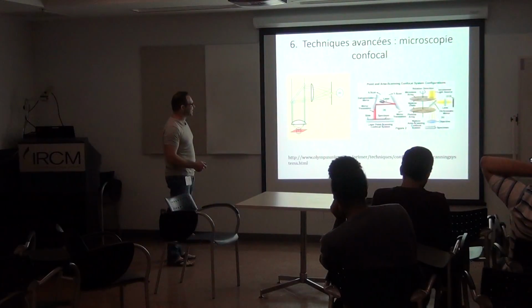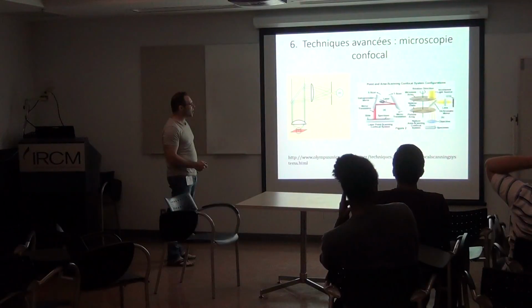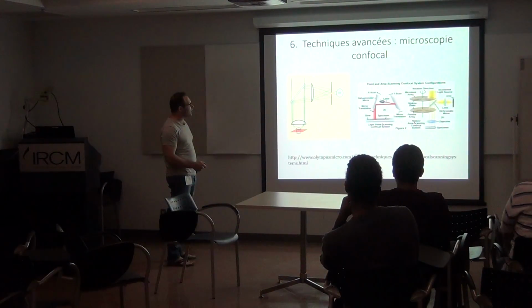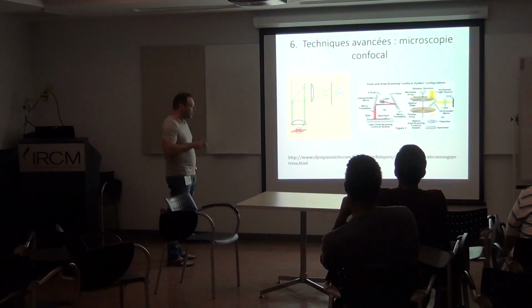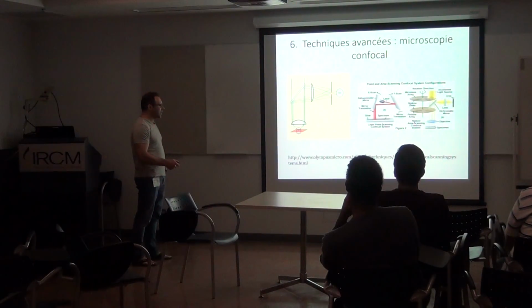Okay, that's good. So with the confocal, you use a little aperture, and it's called a pinhole. Really small things that allow light, which is only the light that occurs at the focal position.